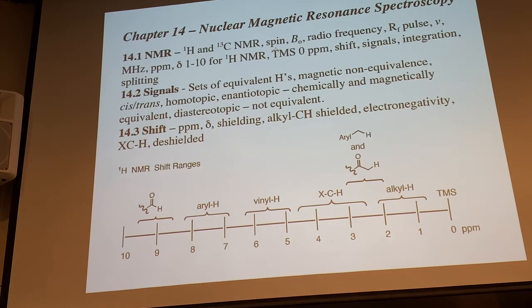And the resonance effect here is governed by radio frequency radiation, which is actually the lowest energy form of radiation. These are very long wavelength, low frequency events, which are very low in energy. But this radio frequency, the RF pulse, will be used to take the nuclear spins out of resonance from an external magnetic field, B naught here. Okay. So it's kind of a complicated setup. I'll show you how the spectrometer is set up here. It's a very sensitive instrument, has a lot of very high-end electronics in it, and the strong magnetic field to do this experiment. I'll give you a little feel for that.